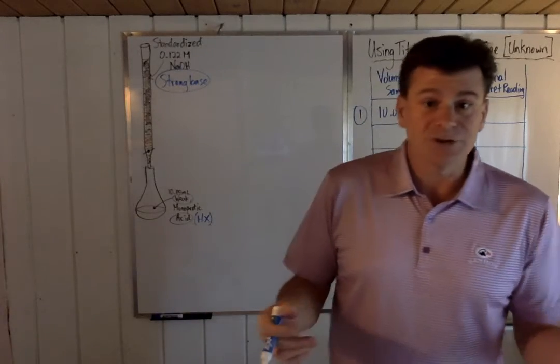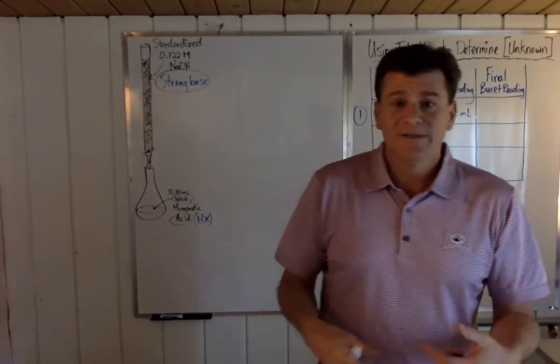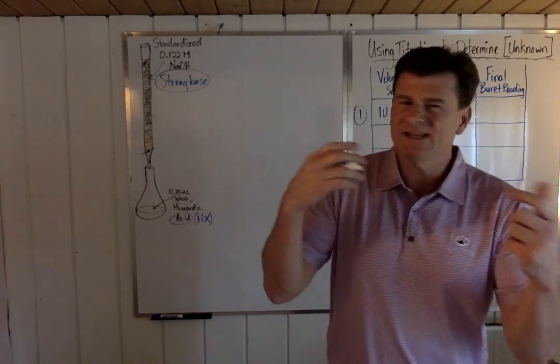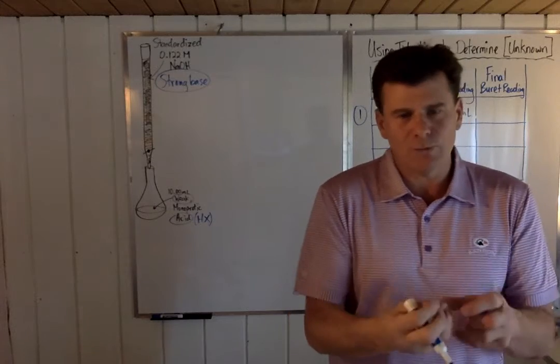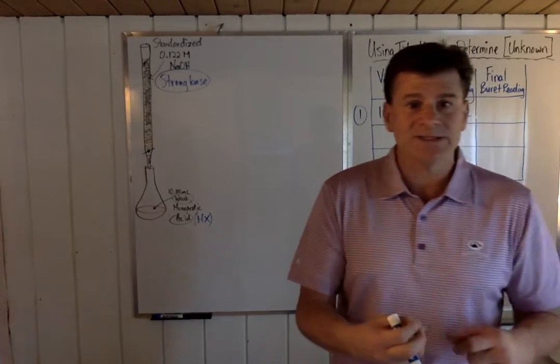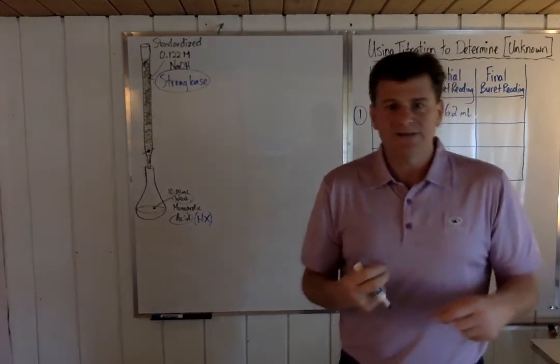Then you start doing the titration. You're ready to go. You put your hand on the little valve and start opening it up and pouring in the base. What you'll typically see, just in case you haven't ever done one, is that as the base pours in, right where it splashes into the acid, you'll often see a little splash of pink, because the base hasn't quite reacted with the acid yet, so it's super basic in that one little spot where the base is hitting the sample.